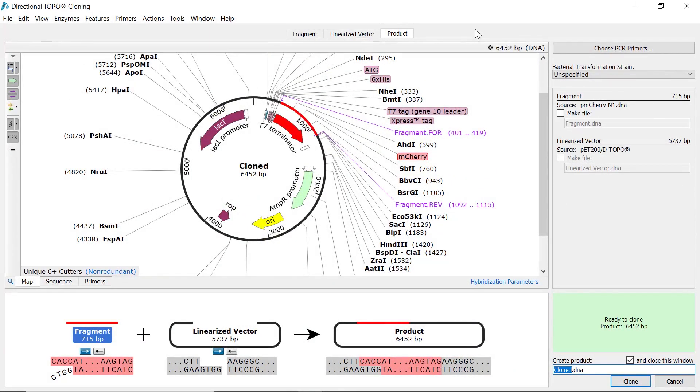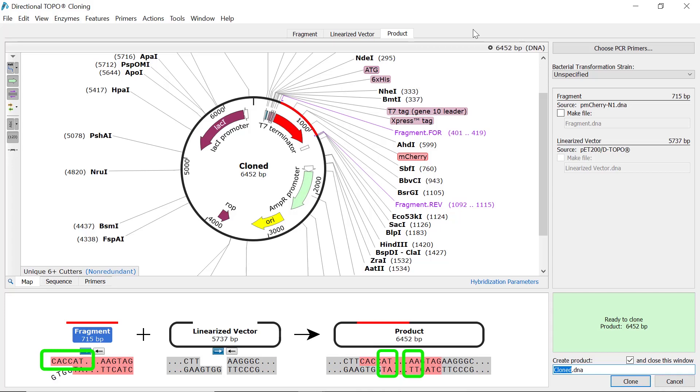When simulating directional topo cloning, the preview window will look slightly different. This is because the forward primer includes a 5' CACC motif which is required to ensure directionality.